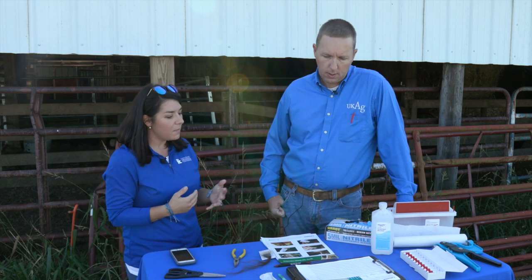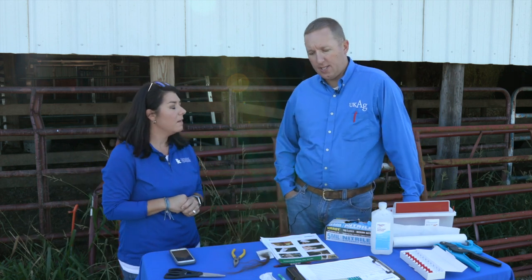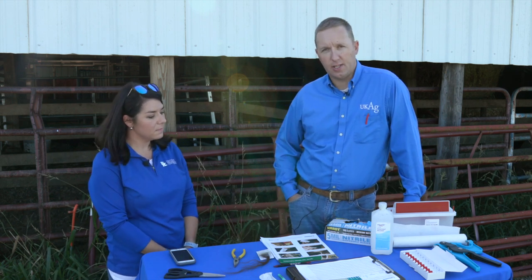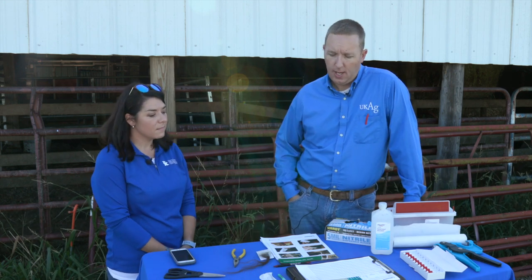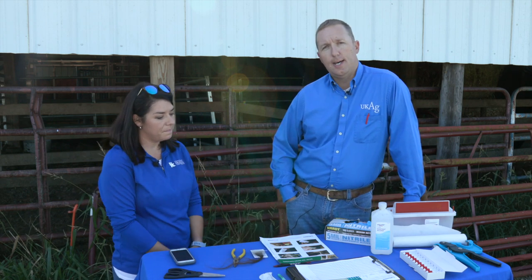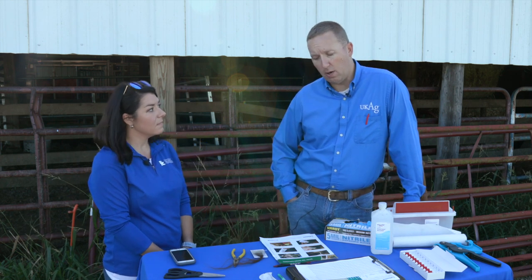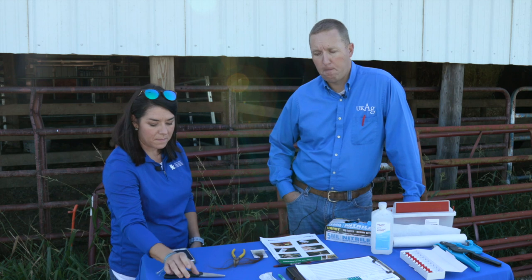Are there other options if we don't want to do the hair test? The hair test is the easiest to collect, however it gets a little tedious in that we have a higher rate of failure for samples in the lab. It takes somewhere between 30 and 60 hair follicles and making sure that we get the root of the hair in the sample to get a good quantity for our lab, but the failure rate is much much higher there, so we're paying for a little bit of inconvenience.